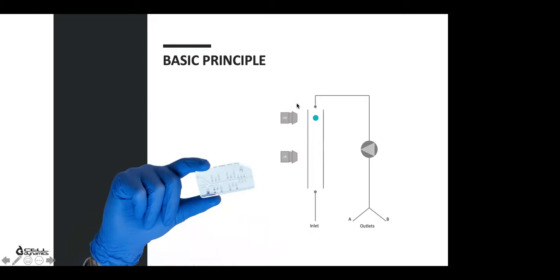And in addition, the weight software calculates the radius of the sample and approximates its shape to predict the sample volume. So we have the mass density, we measure the sample volume, and in the end, we can extract the weight of the sample in nanograms.